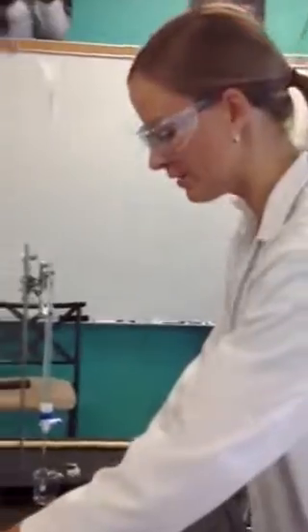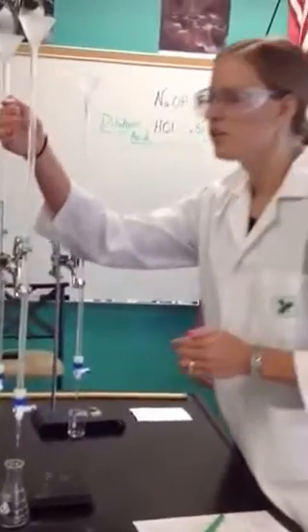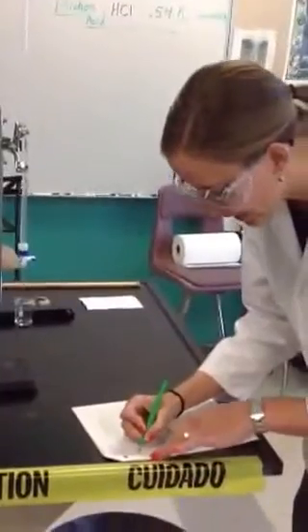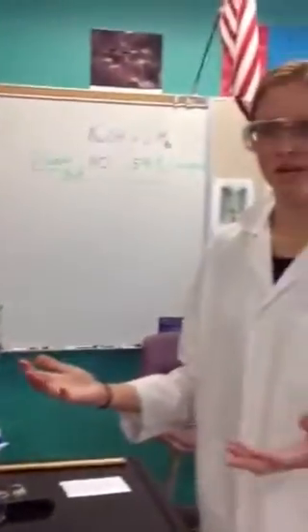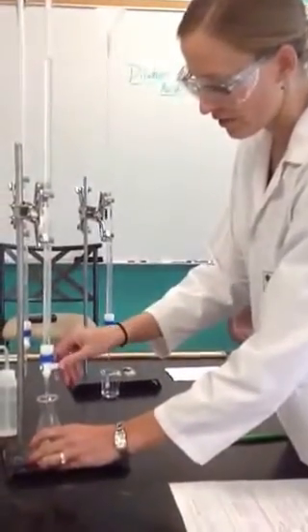Then we're going to come over to our burettes. All of our acids are going to be at the front, and we're going to take an initial reading of the acid. Right now this initial reading is at 7.1, so I'm going to record that in my data table. If I'm at 7.1 and I want to get 10 mL out, my goal is 17.1. Going over 17.1 is not a source of error — I just need to record it. Ten mils is just a little bit easier for our calculations.